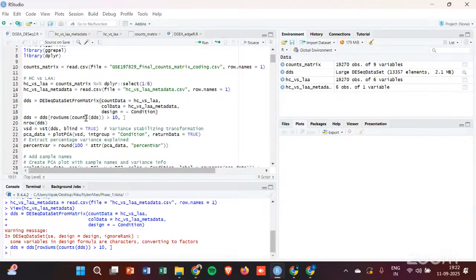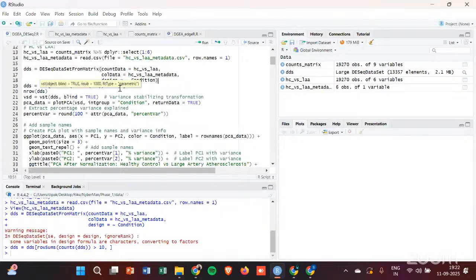Moving ahead, now that we have filtered, we can check how many genes remain. Shodadev, one more question. If I add, because we have to write condition, then plus, space, then suppose gender. Yes, space and all, that is fine. If you even put a space here, that won't matter.